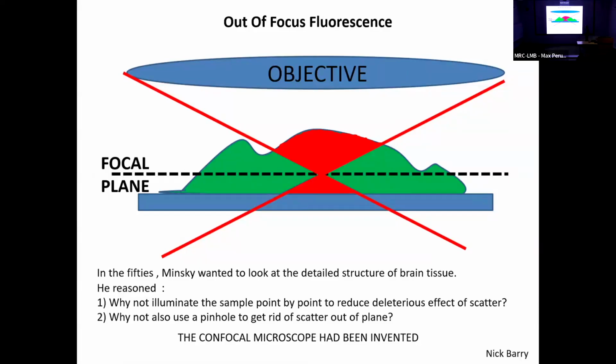Now, we'll step back away from this. What was the genesis of the confocal microscope? How does it deal with this problem? There's this chap Minsky in the 50s. He wanted to look at the detailed structure of the brain.